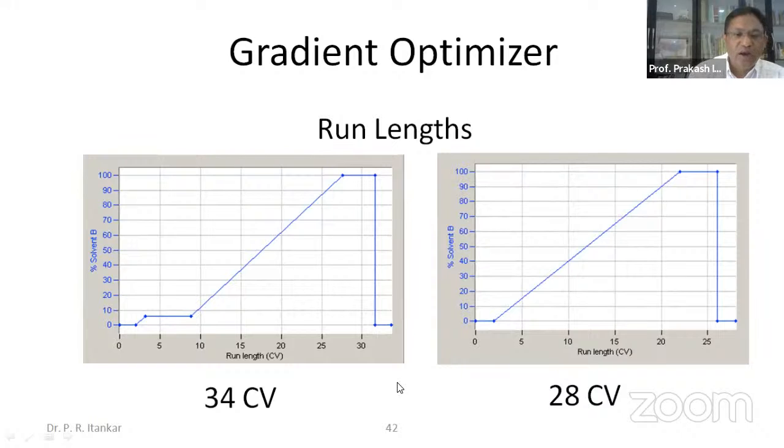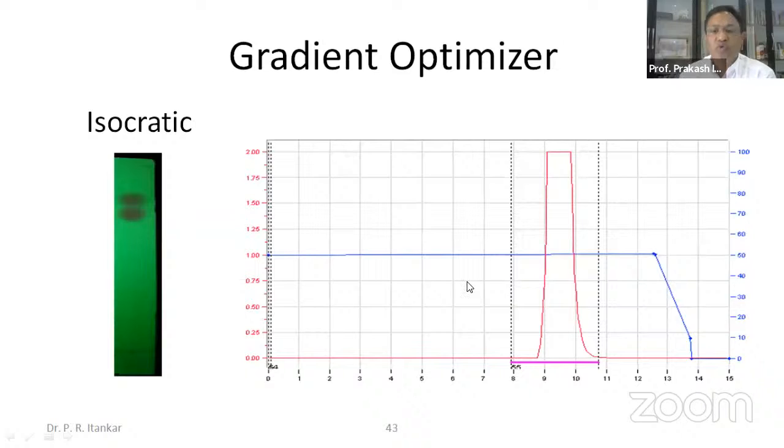that you are handling, and based on that, you can give a command of the percentage of solvent B, meaning the gradient can be fixed as shown here. So you can simply click and drag, and while the process is going on, you can achieve that particular separation. So the gradient optimizer is working for you. You can see here the gradient was kept the same till we achieved a particular separation, and then the gradient was taken down. So this can be selected manually on the screen.